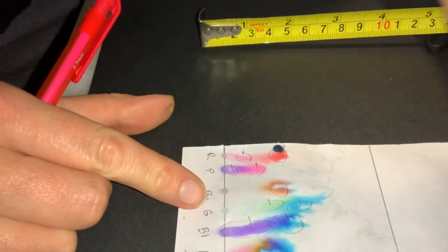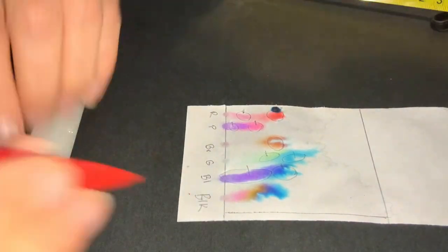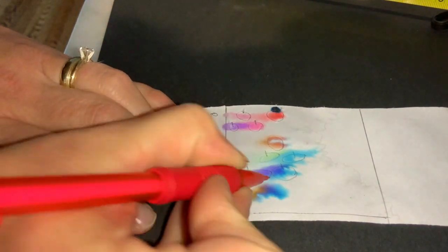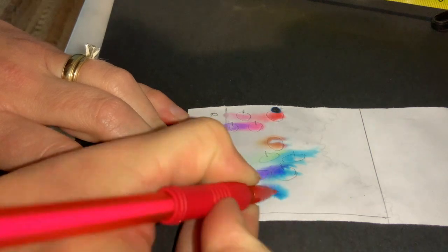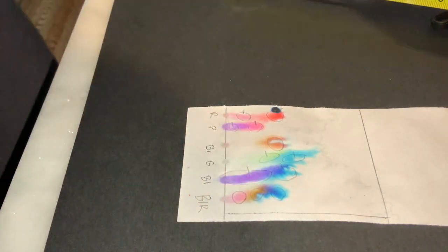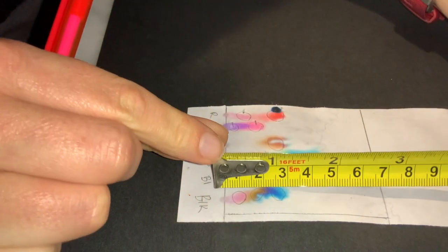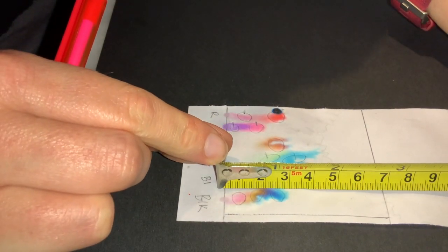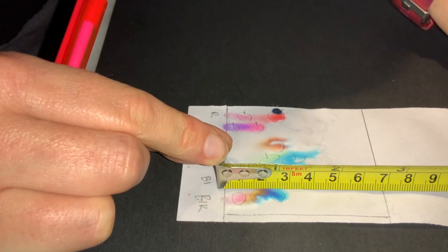And then finally, our black. So we've got quite a few colors here. We have this, that, and that. So again, you want to measure the distance to the center point of each of those spots.